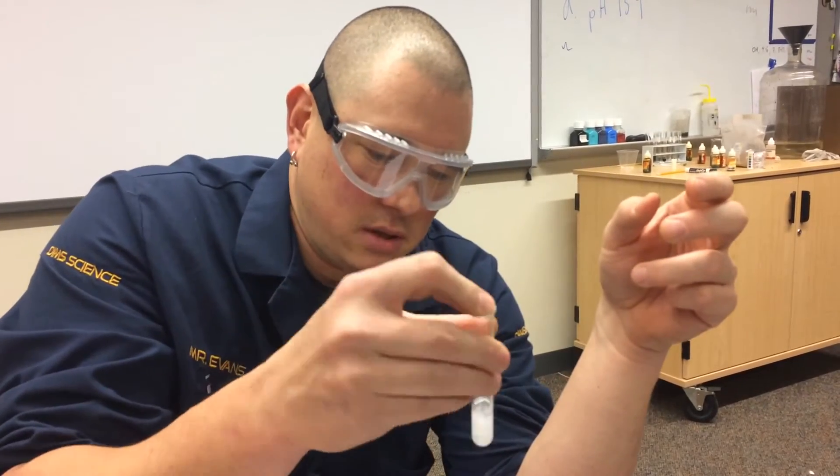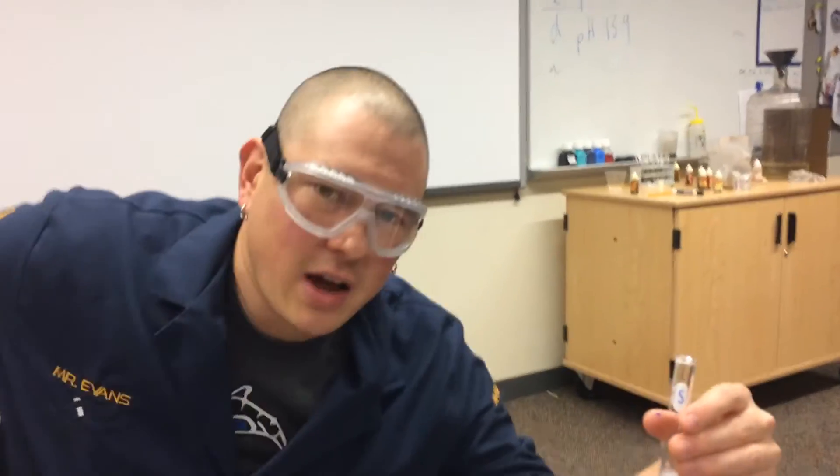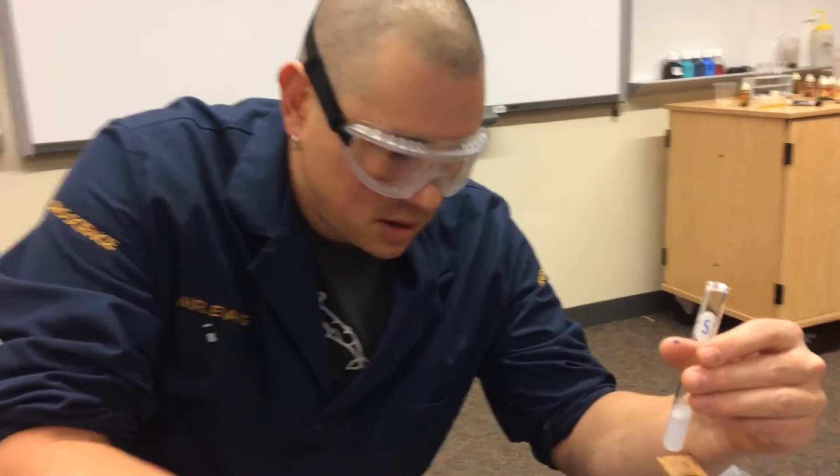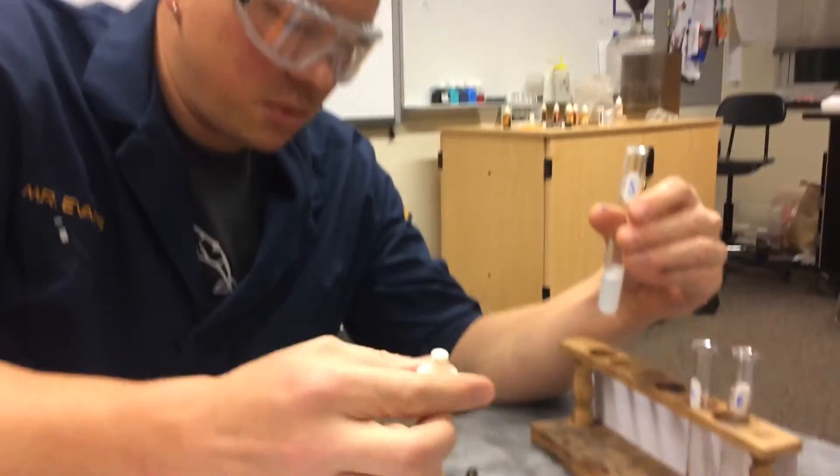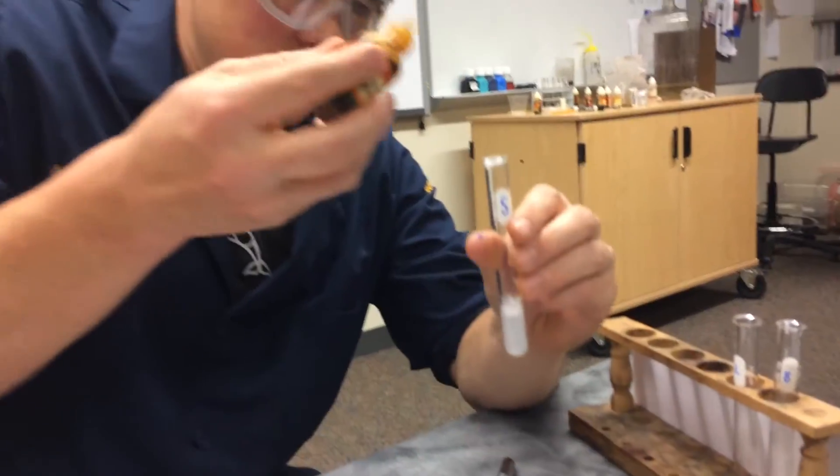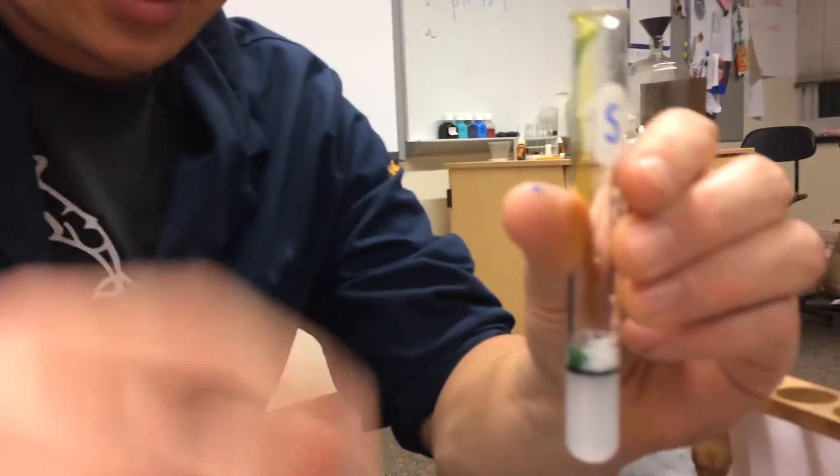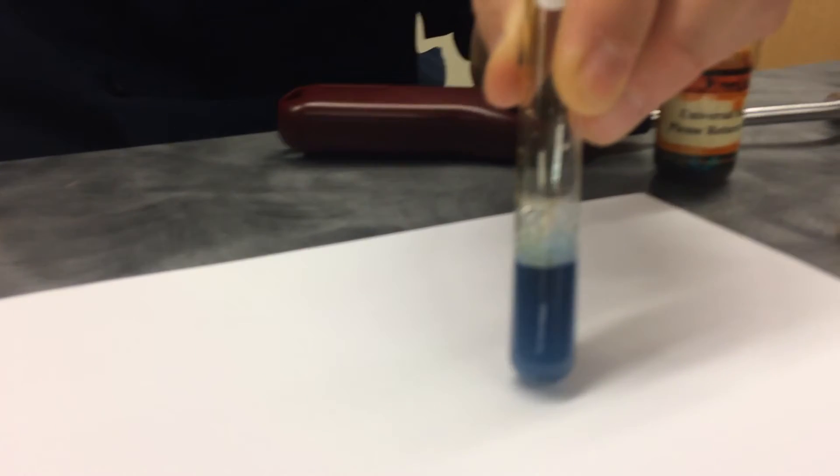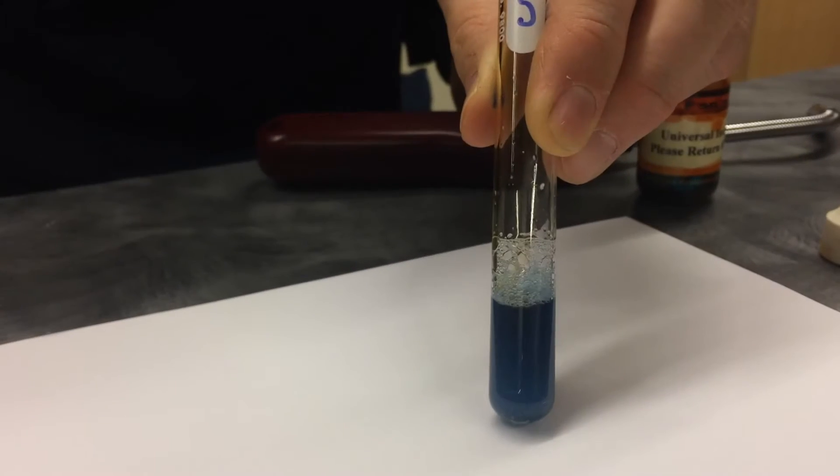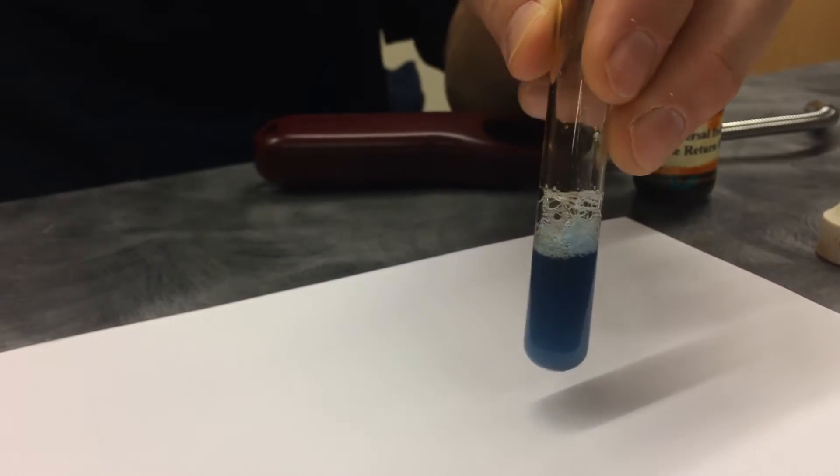Shake it up a little. Okay, hopefully you have your prediction. Now I'm going to put a drop or two in here. Let's see what happens. Look at that. I like that. It is definitely kind of a darkish blue. So write down what it is. What pH do you think that is?